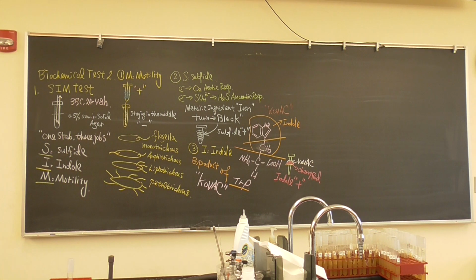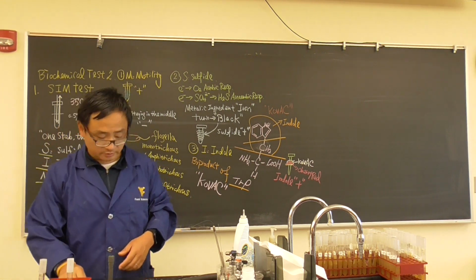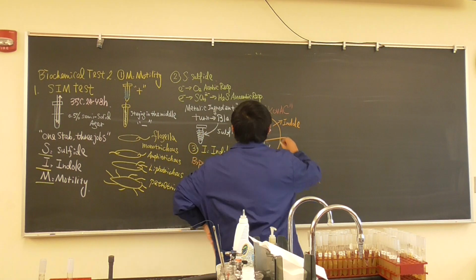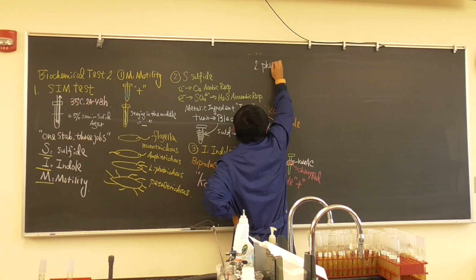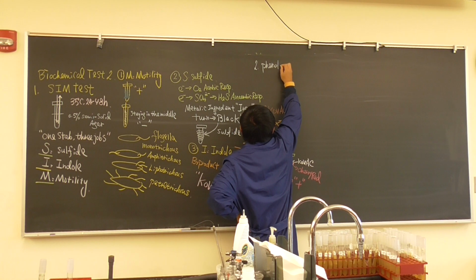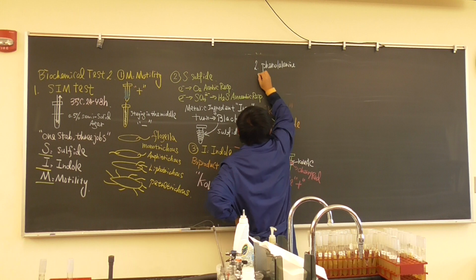Next one. This is a very simple slant. Looks like it's the same. What is this test? So test number 2. Phenylalanine deaminase test.